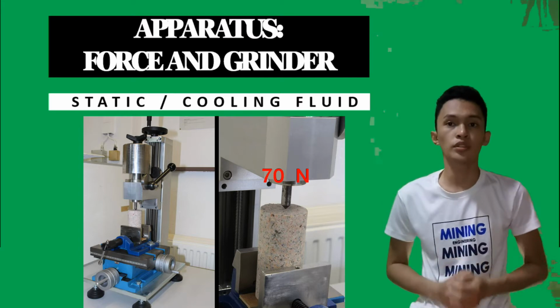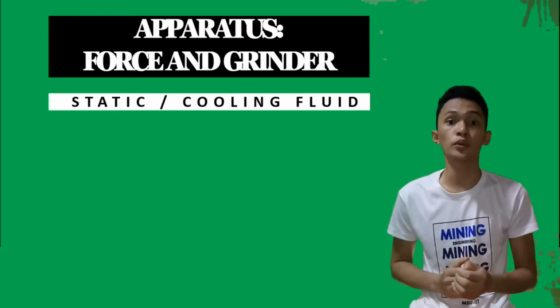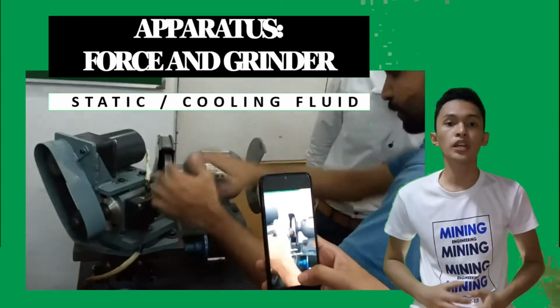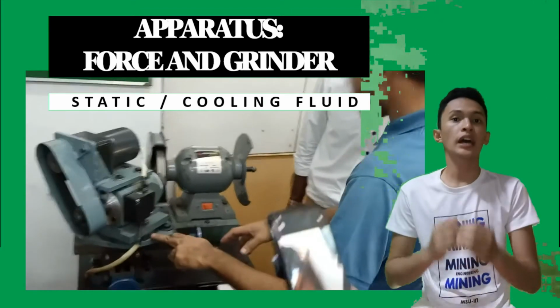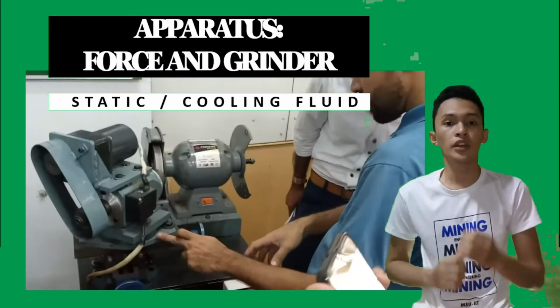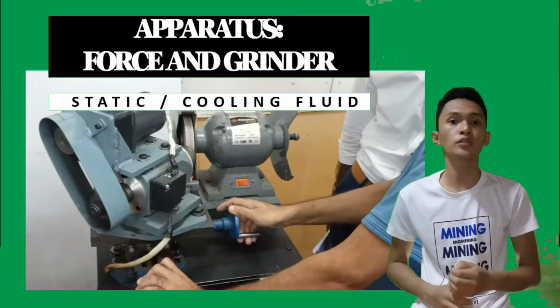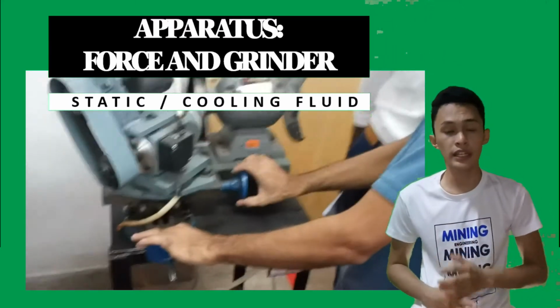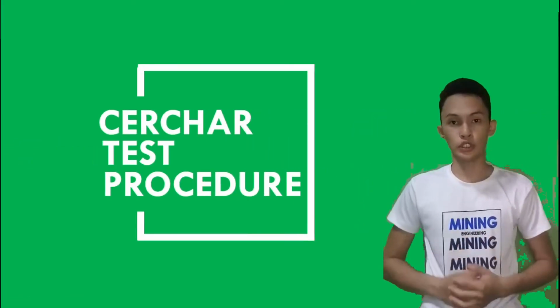Each used stylus should be resharpened using a standard abrasive stone wheel. The grinding wheel should have a fine grit to avoid leaving a rough surface at the stylus tip. The use of suitable cooling fluid that will prevent any change in stylus hardness as a result of grinding is mandatory. Now, let's go to the test procedure.